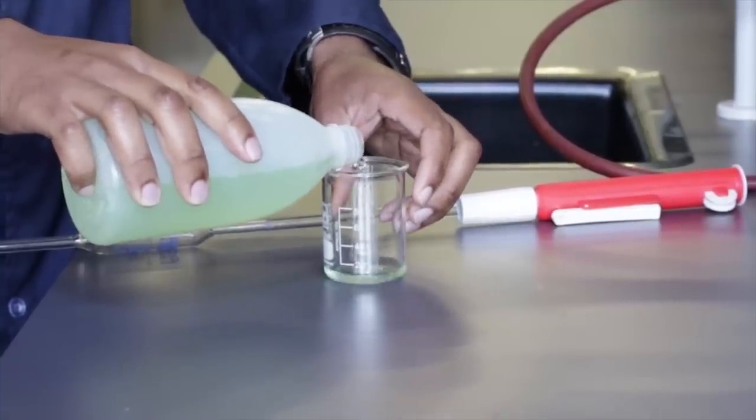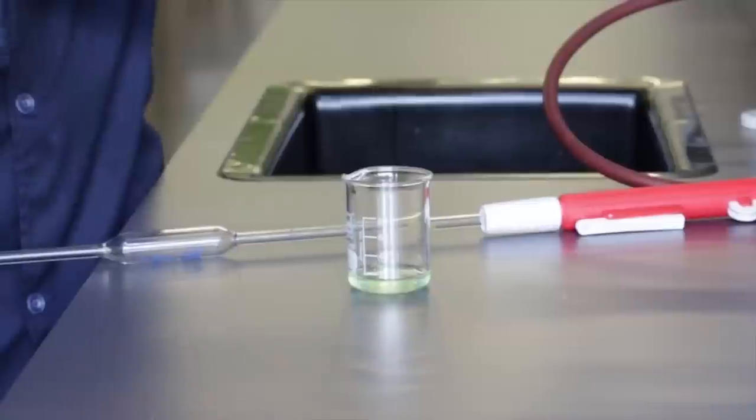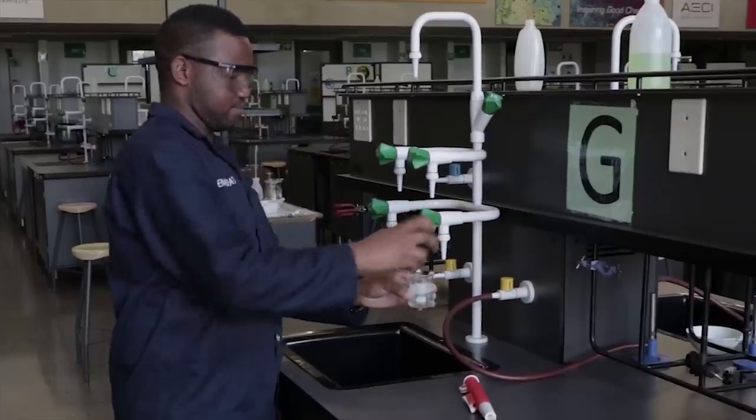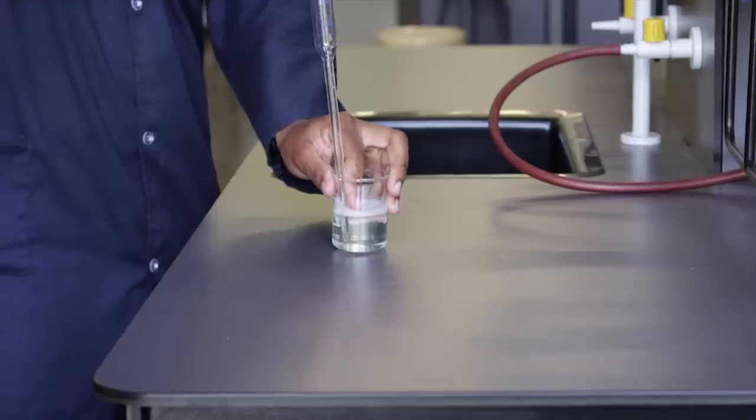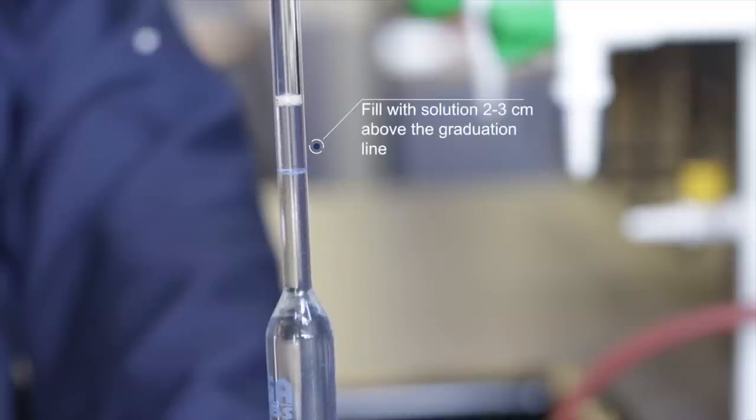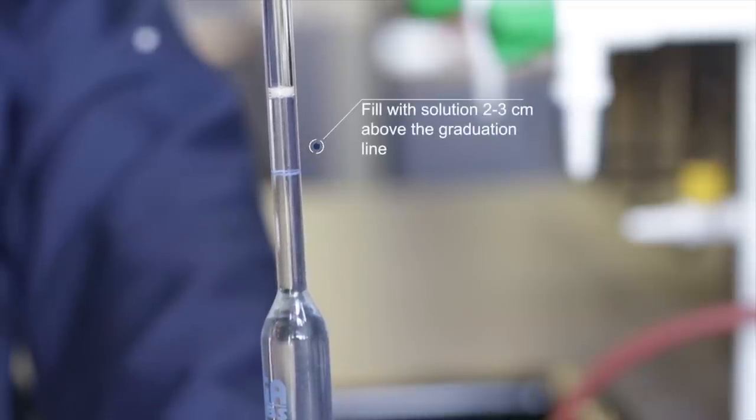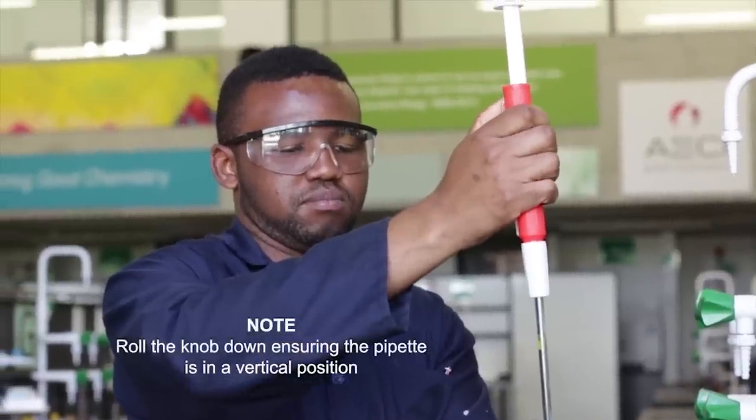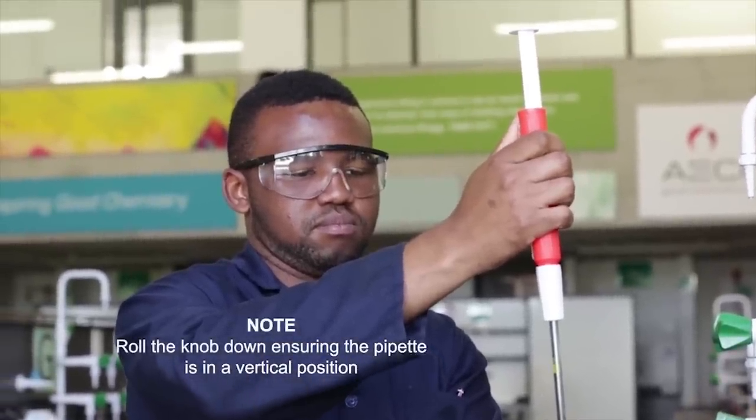Approximately 10ml of cleaning solution is added into a beaker where the solution is diluted with water. The pipette is then cleaned by sucking up the diluted cleaning solution approximately 2 to 3cm above the graduation line by rolling the knob downwards, making sure the pipette is in a vertical position.